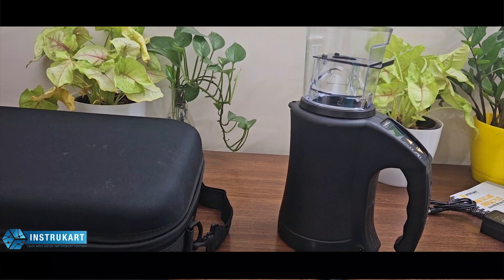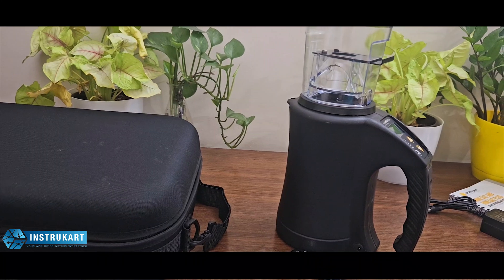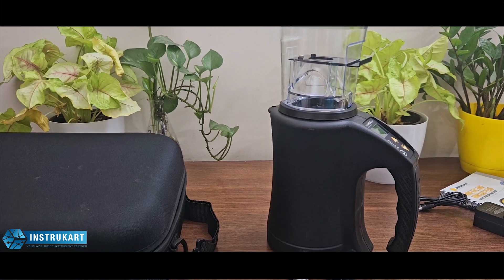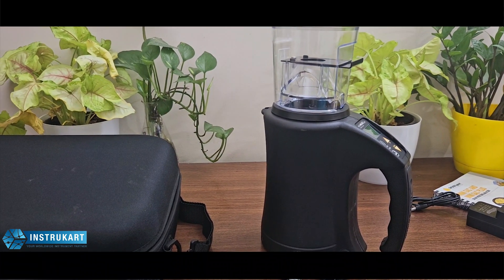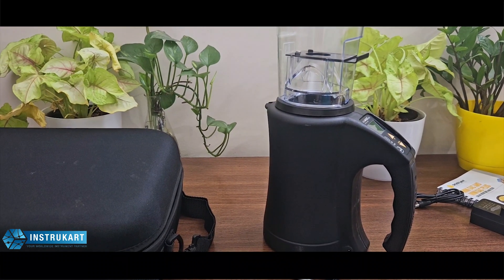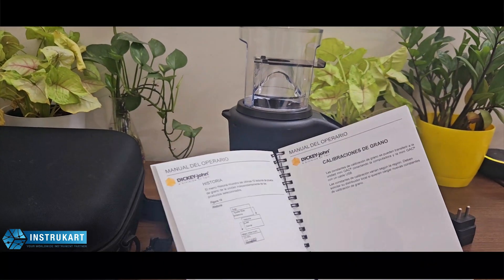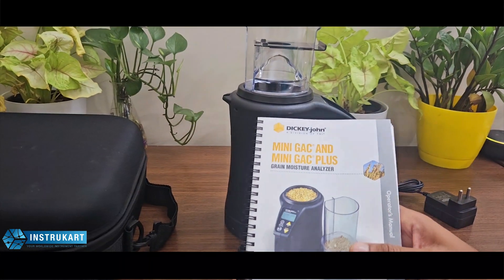This moisture meter can be used in applications like laboratories, farming, and any kind of moisture testing or withering process you are doing on the farm — such as cashew, corn, soya bean, or any product you are processing. It also comes with an instruction manual in all major languages that you can refer to.